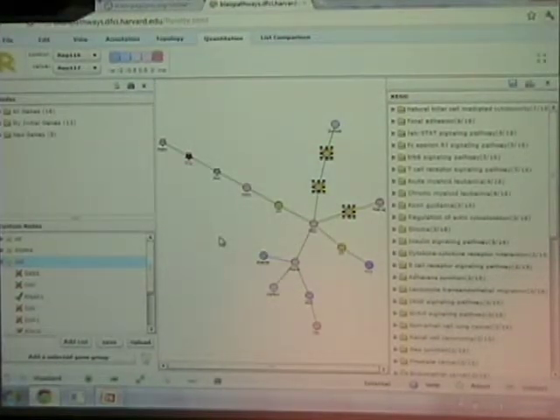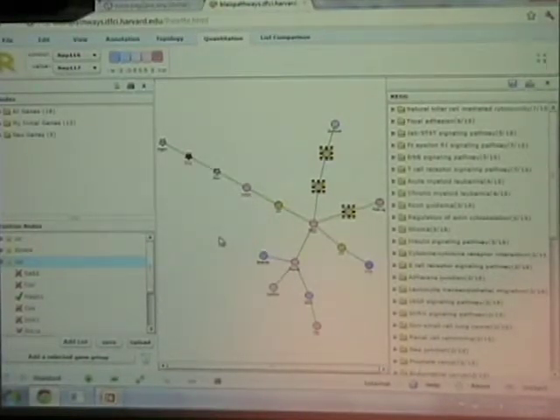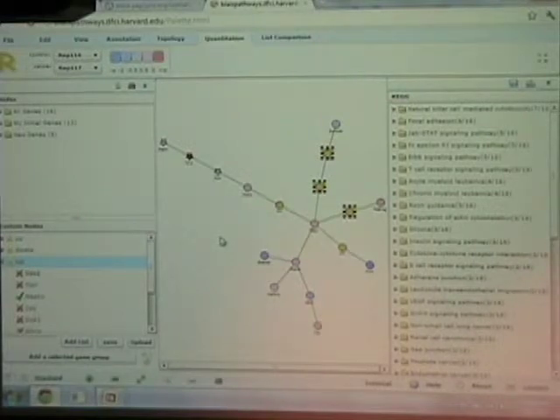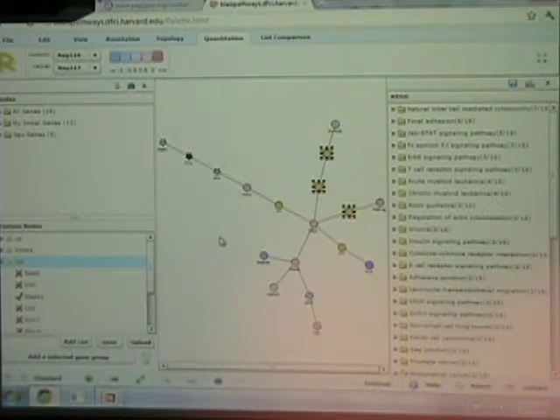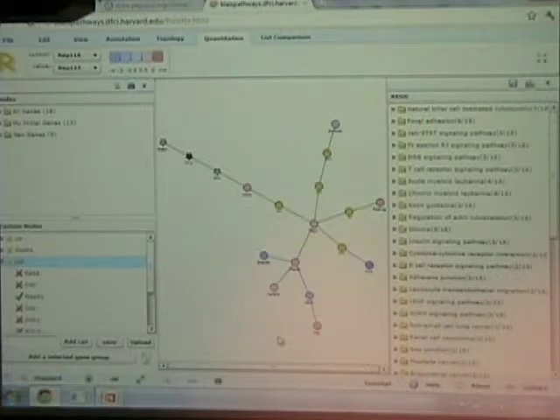All of this is just in the realm of an interesting observation. The statistics for this stuff is still in its infancy, and also our understanding of the network of protein-protein interactions is, it's really premature to do this sort of thing with the databases that we have. But it's nice that it's in principle technically possible. Yeah, so all you need also to run this is a browser that runs Flash. I forgot to mention that, a recent browser. So all of this is happening in a browser. Sometimes people assume that I'm running a desktop-based app for this.